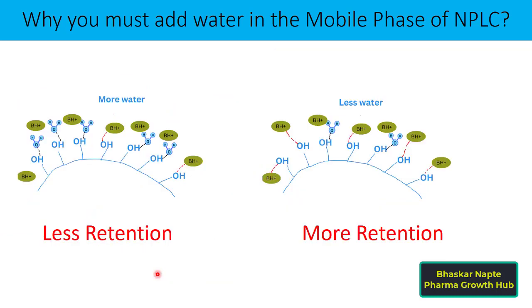So more water means less retention, and less water means more retention.